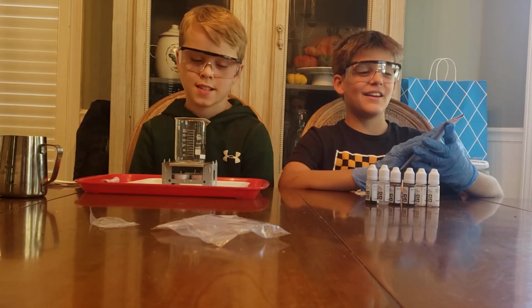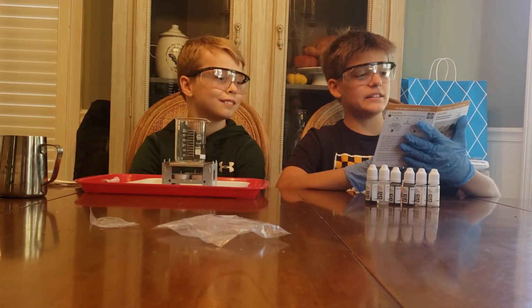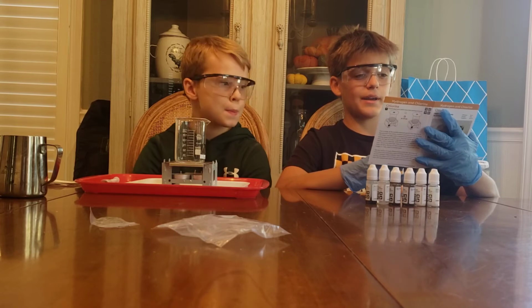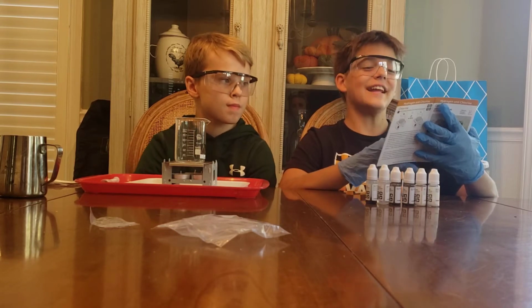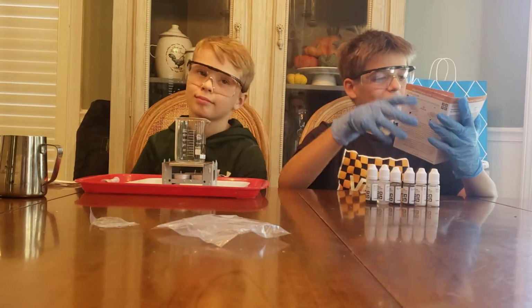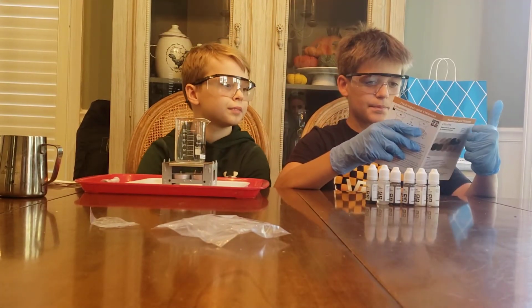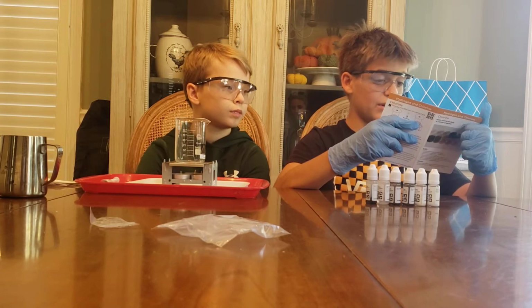We're going to be kicking it off with hydrogen and chlorine. The first step is to perform the experiment in a well vented area. Keep a pitcher of water nearby. We got that. Check. Perform the experiment in a well vented area. Prepare a pitcher of water.